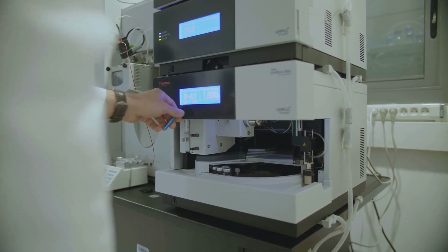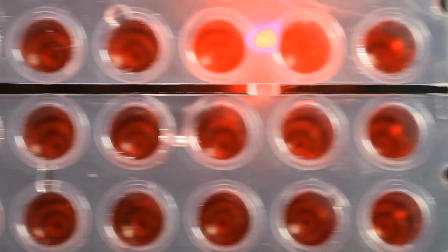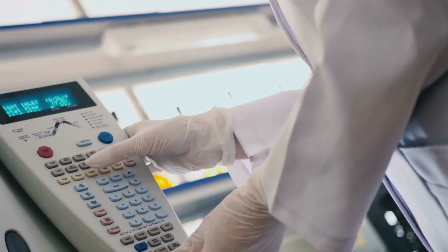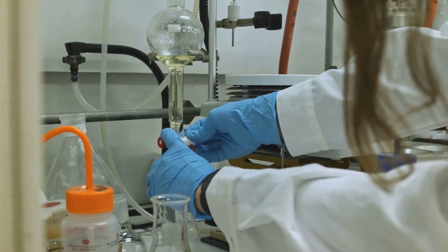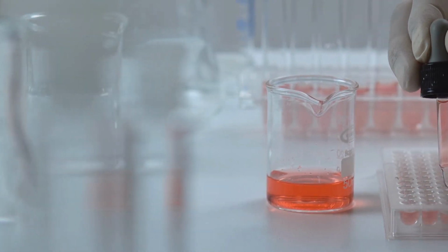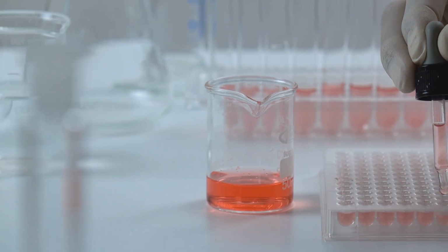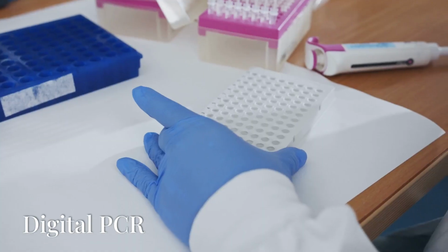Mass spectrometry. Mass spectrometry based genotyping methods utilize the principles of mass spectrometry to identify and quantify specific genetic variations. Techniques such as matrix assisted laser desorption ionization time of flight, also known as MALDI-TOF, and selected reaction monitoring, or SRM, allow for the high throughput analysis of genetic variants. Mass spectrometry-based genotyping is often used for single nucleotide polymorphism, or SNP, genotyping and detection of specific genetic variations.